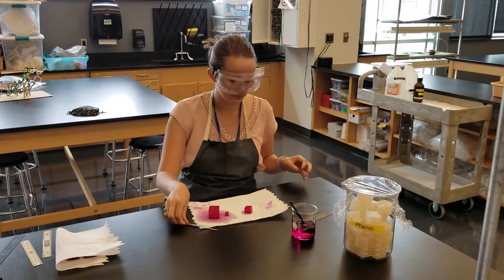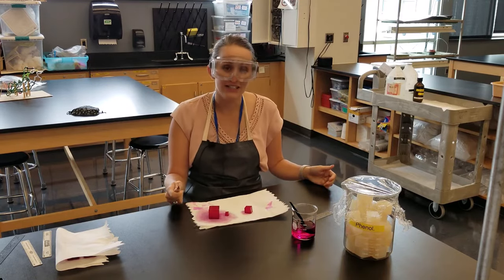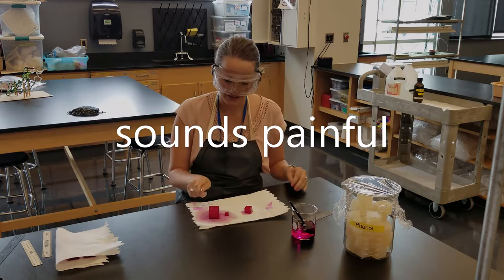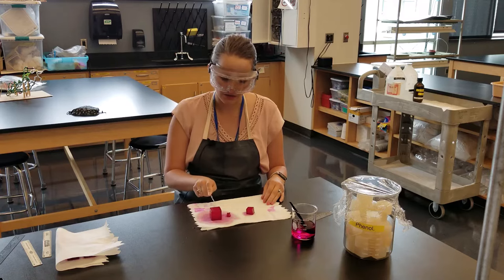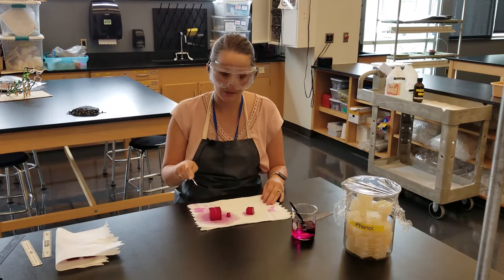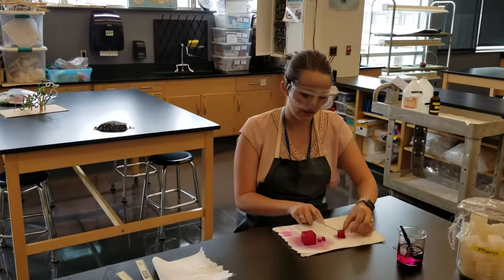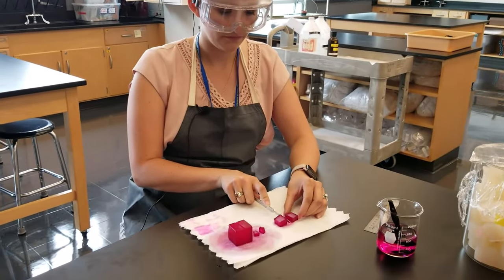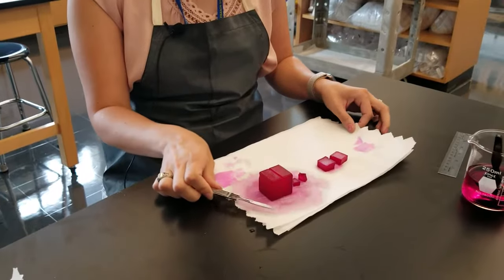What we're going to do now to look at our data is chop these cubes in half — just like a little guillotine. For this first one, the three by three by three, I'll take my scalpel and go straight down the middle, and I'm going to do that for all three cubes. We can see that the insides are white, so let's take a look at our data.